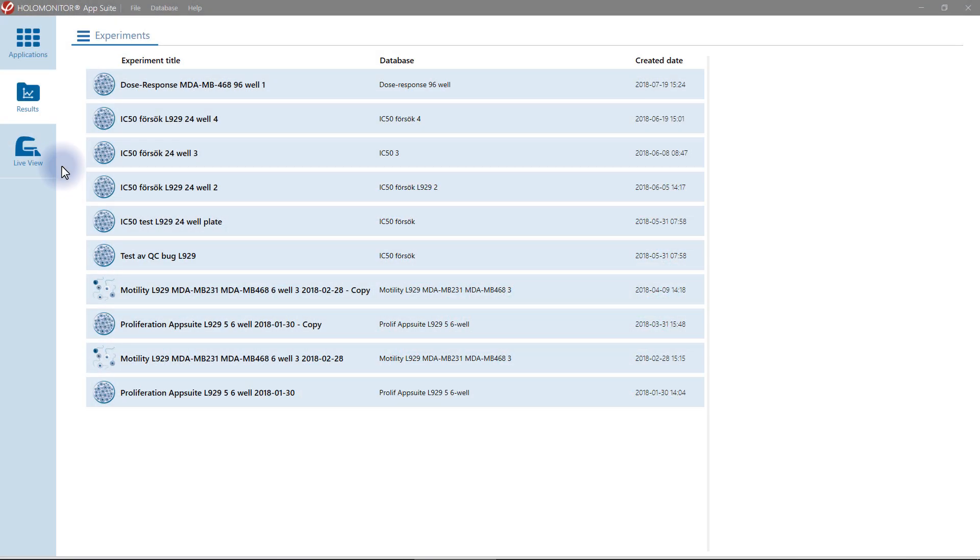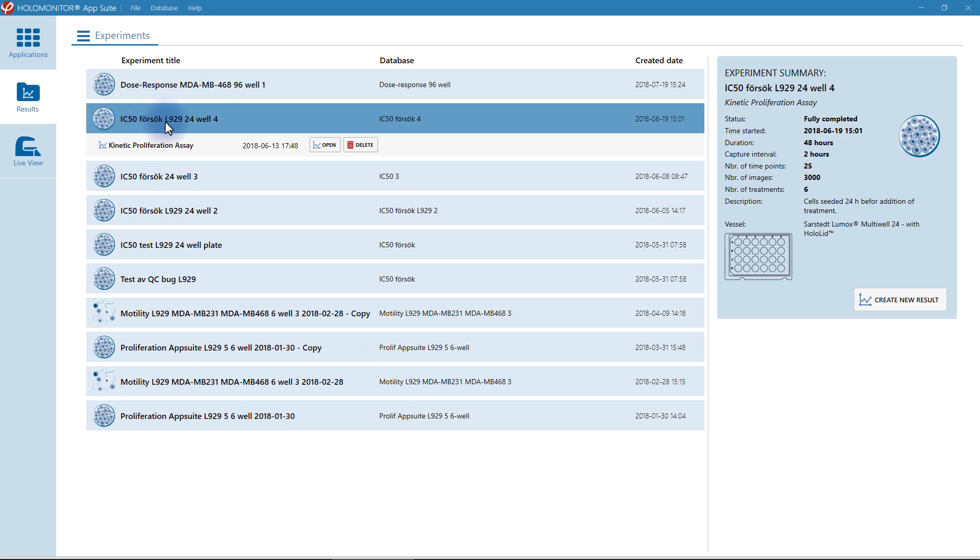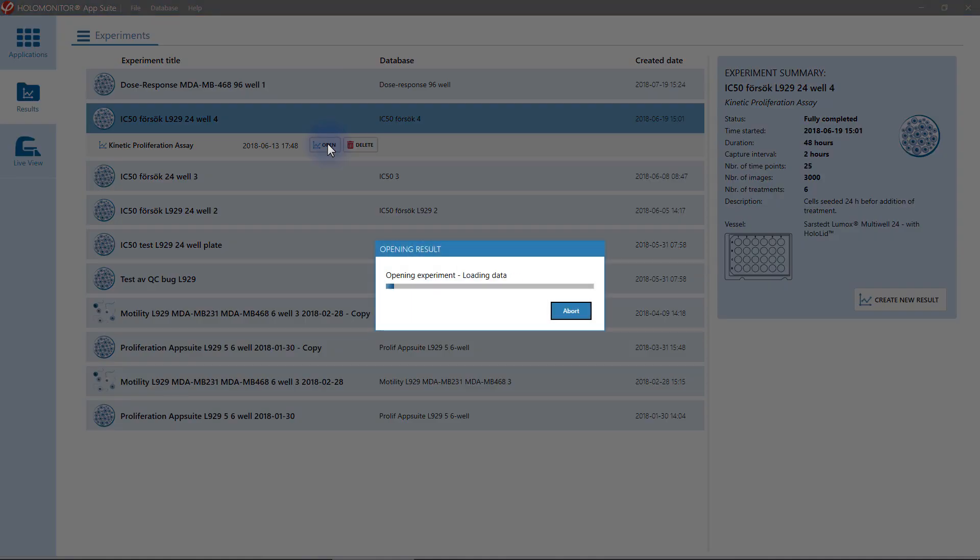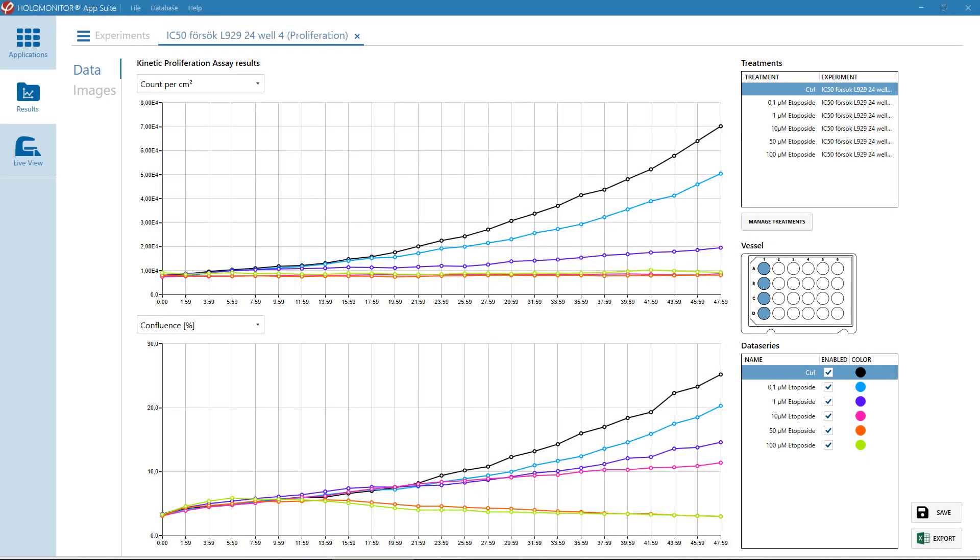All your data is stored in a result folder. Just select experiment and relevant results. Graphs, tables, and images are immediately provided. And if you wish to investigate results in further detail, the data can easily be exported to Excel.